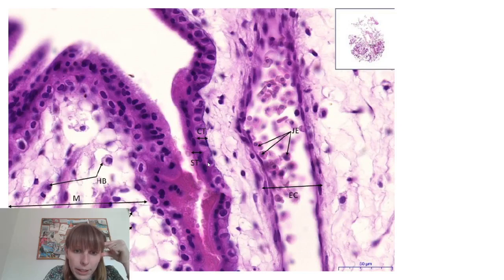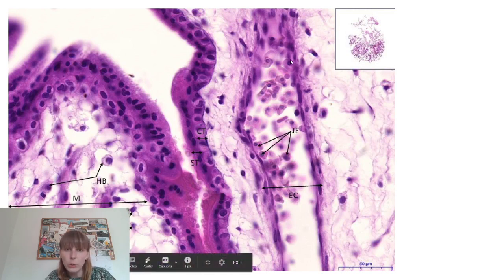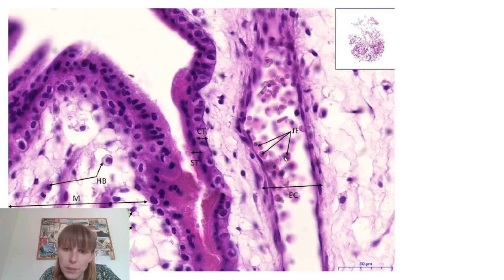So we have one layer, second layer. So this is telling us it's probably first trimester. We want to check, so we take a look inside the blood vessel, and we see erythroblasts still with nuclei. So this is clearly first trimester placenta.